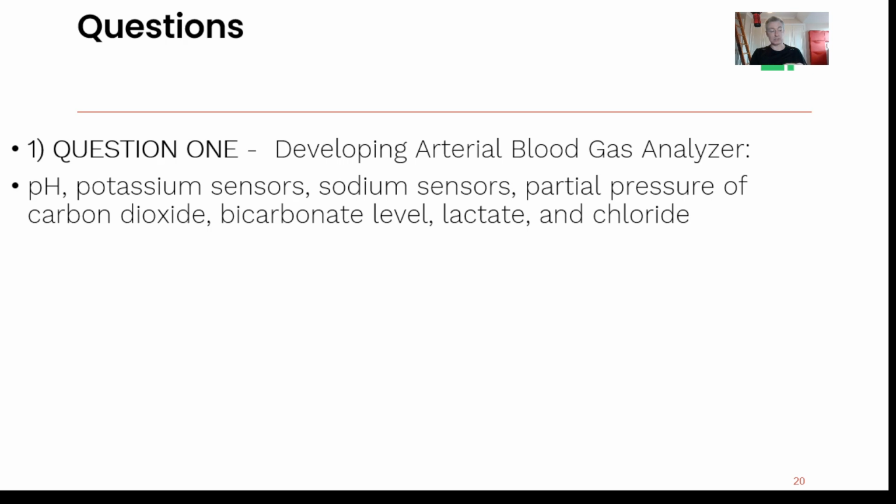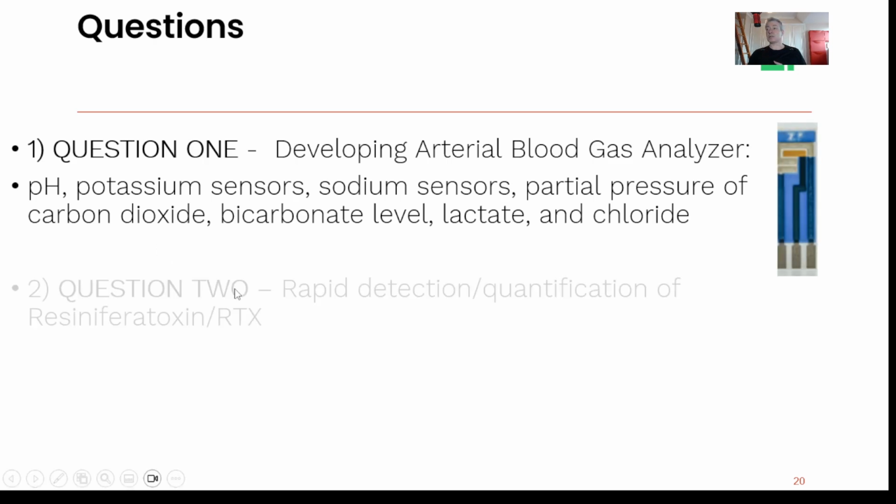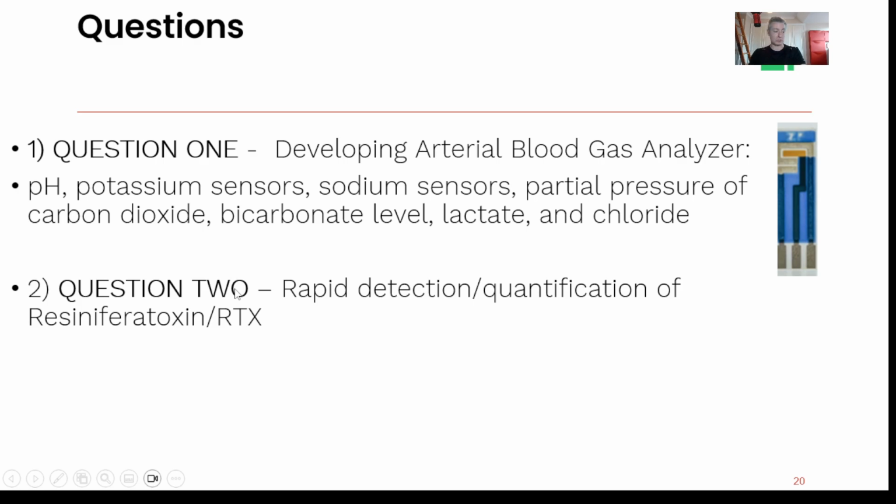That's not what it's intended to be, because if we come up with a calibration, for example, for blood glucose, that doesn't mean that it's worked in urine. So you find out that for every application, there's still a bit of science to be done. But the Sensi-All platform is pretty mature, and it's quite nice that it is a multi-analyte system. So you could see today that I could also measure natural products as well.